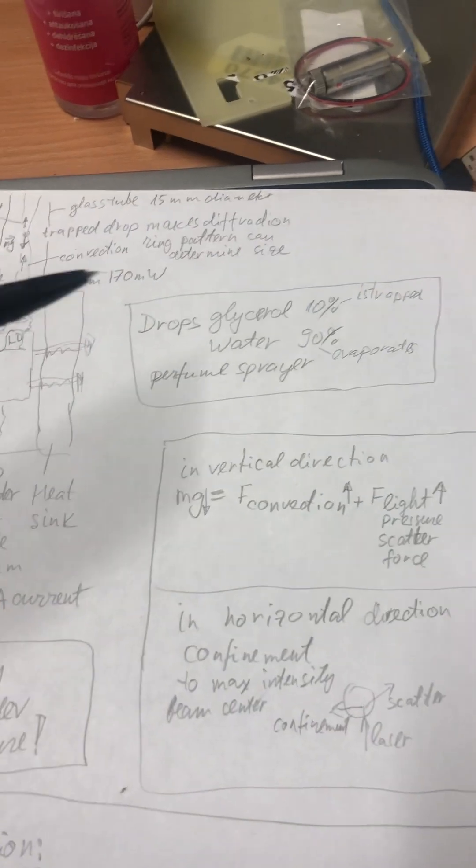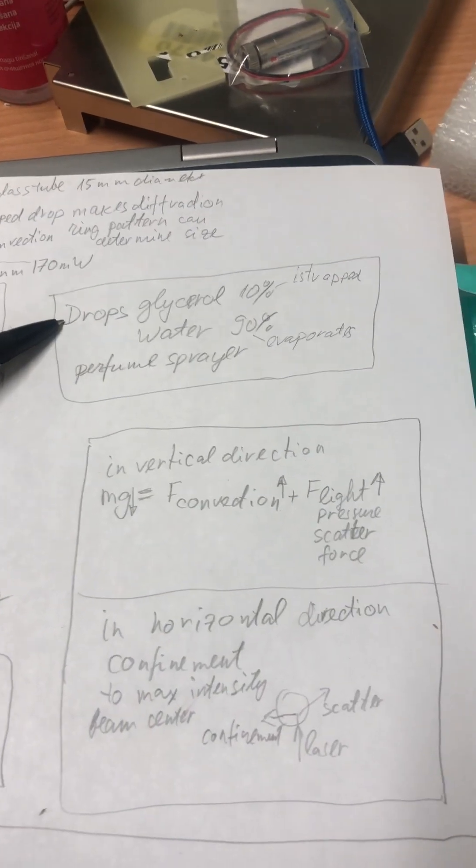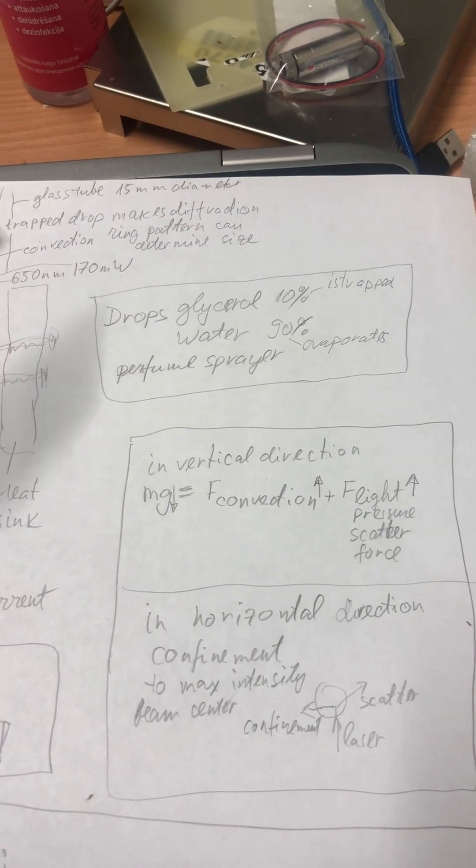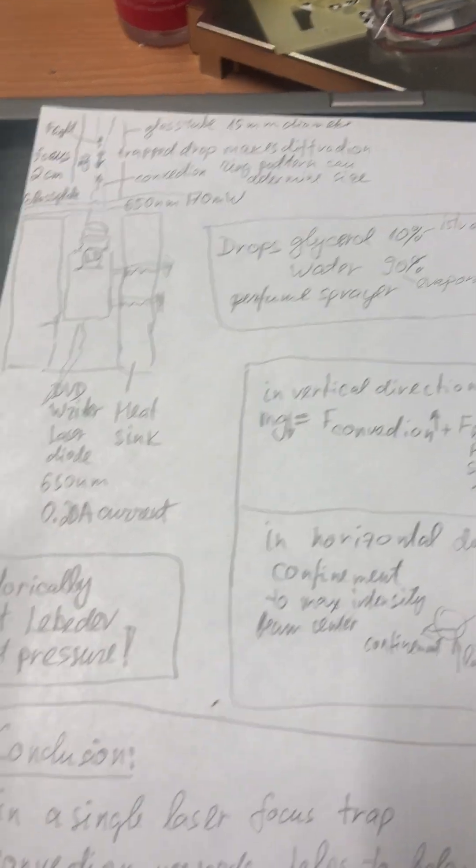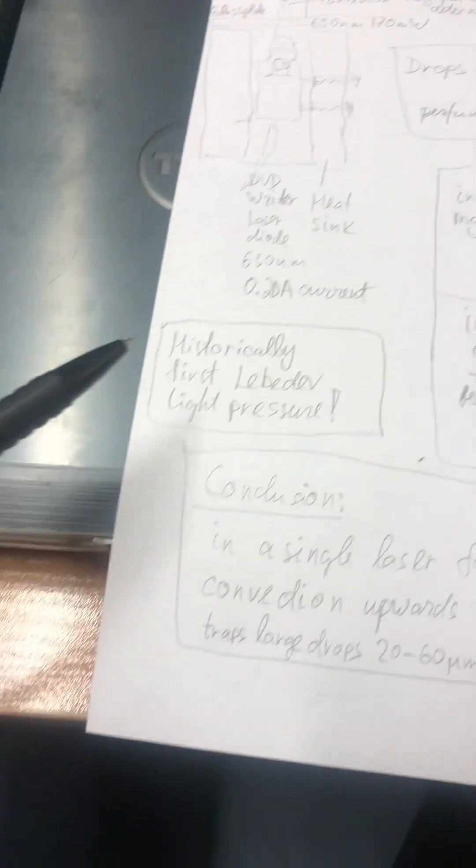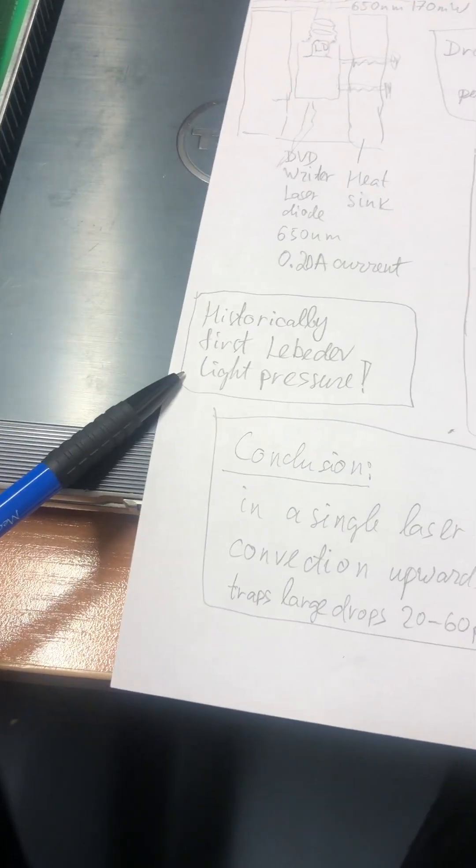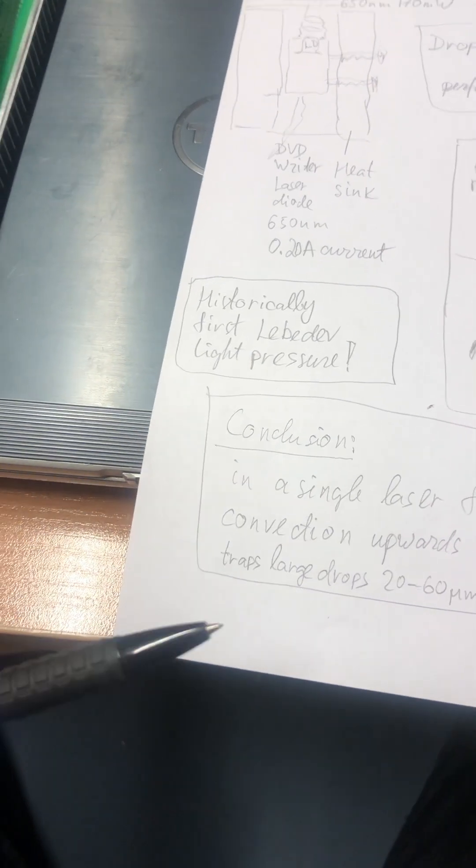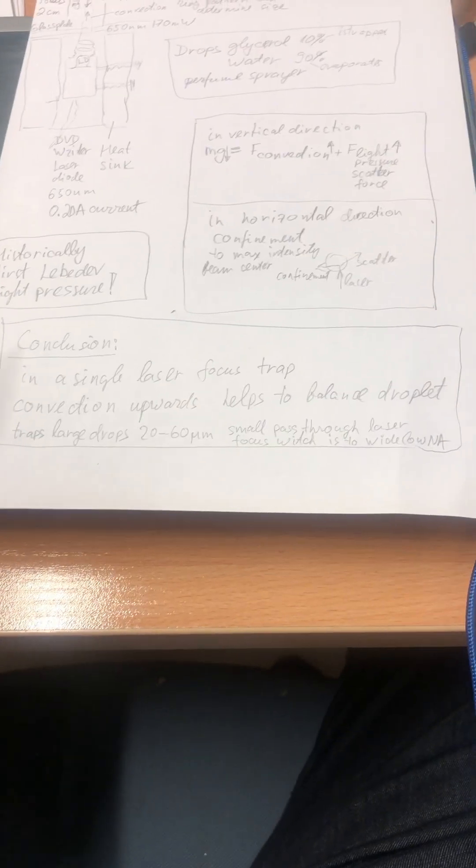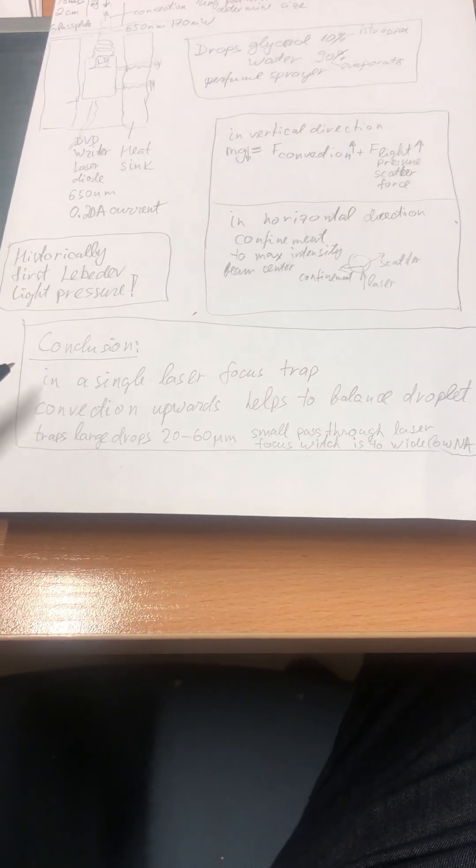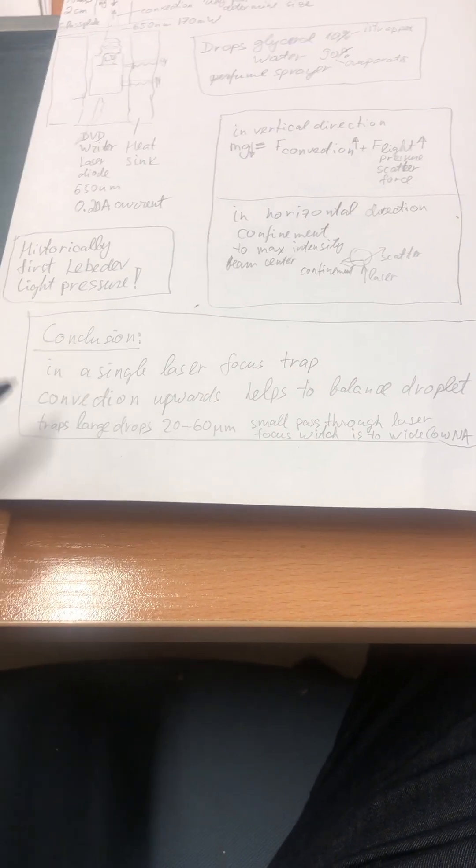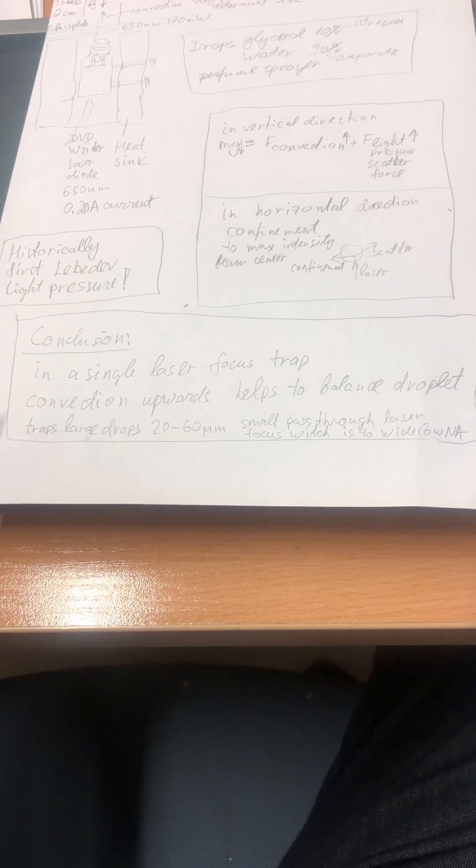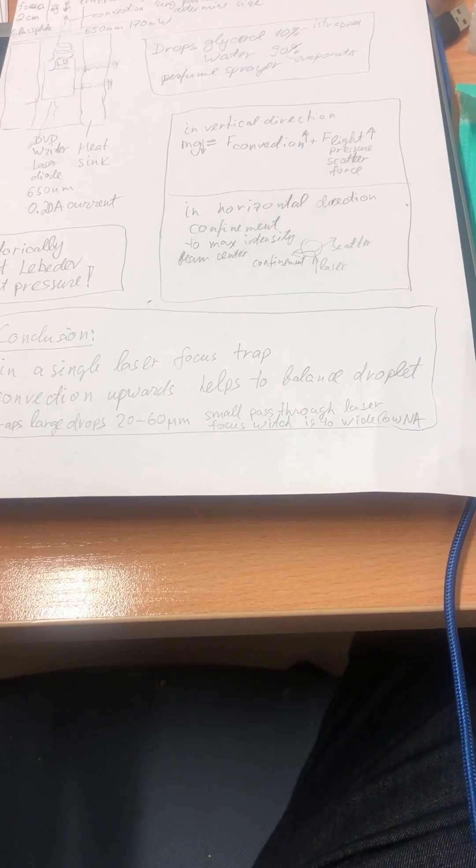The drops are 10% glycerol which does not evaporate and 90% water which evaporates. Historically, first was Lebedev who saw and measured the pressure of light. In conclusion, this is a single laser focused trap. Convection upwards helps to balance the droplet.